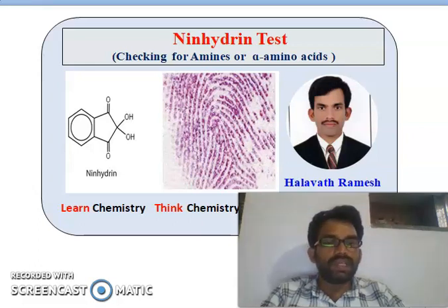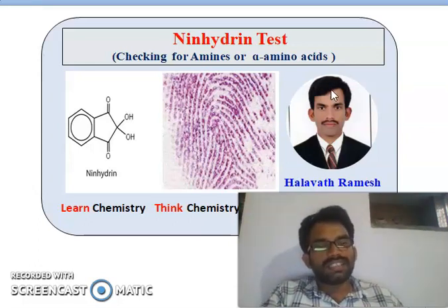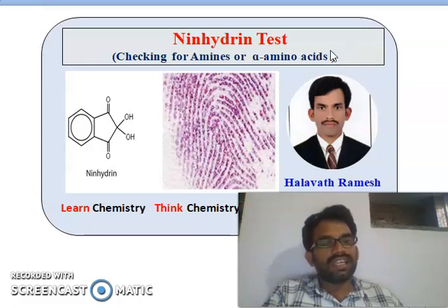Chemistry. Today we will talk about a very general topic, which in forensic science most people are using: the Ninhydrin test. The Ninhydrin test is one part of our chemistry topic. So you can see the caption here. The Ninhydrin test is mostly used for checking for amines or alpha amino acids.